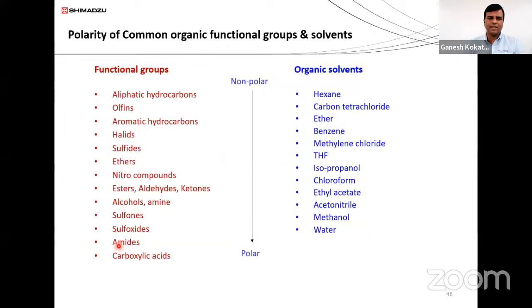Now, this slide is the most important slide of this presentation. We call it the polarity of common organic solvents and functional groups. Whenever you are going to develop any kind of method, just follow this slide. For example, aliphatic hydrocarbons are highly nonpolar. Everybody knows that.